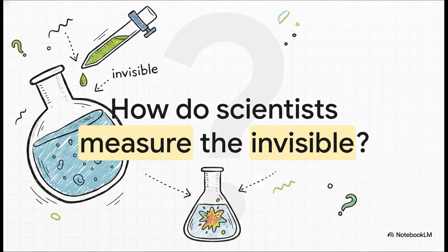So to kick things off, we really need to understand the fundamental forces at play here. An acid-base titration isn't just blindly mixing liquids together. It is a highly controlled reaction, which brings us to the big question we're answering today. How exactly do scientists measure the invisible?